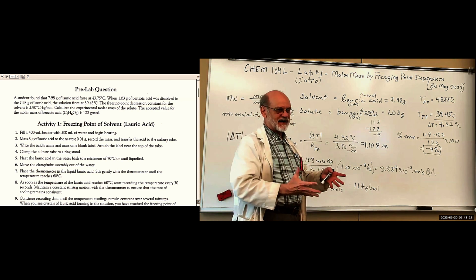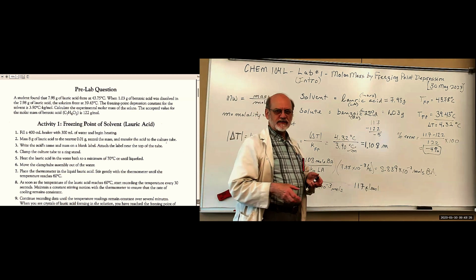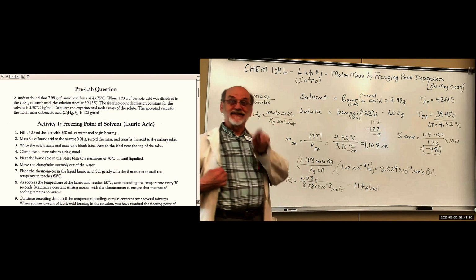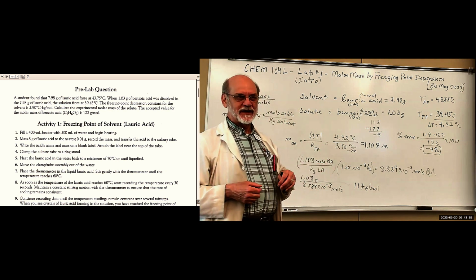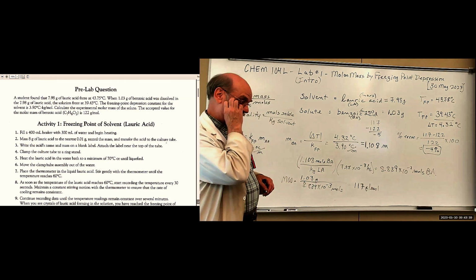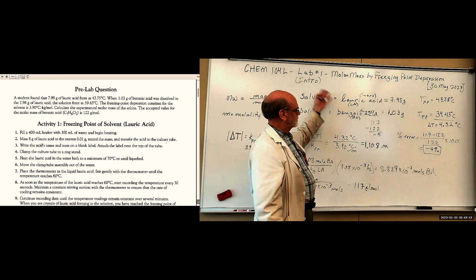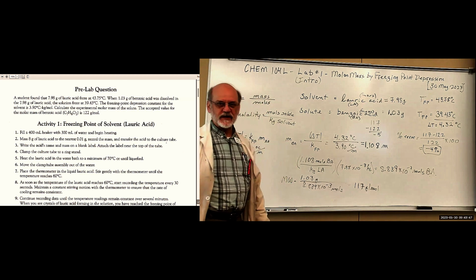And then let it solidify. Then it can be disposed as solid waste. What happens if you pour it down the drain? It solidifies in the drain. And the first time may not clog it, but if that happens several times, it'll eventually clog it up. And these are non-hazardous materials, so we can dispose of them as solid waste.